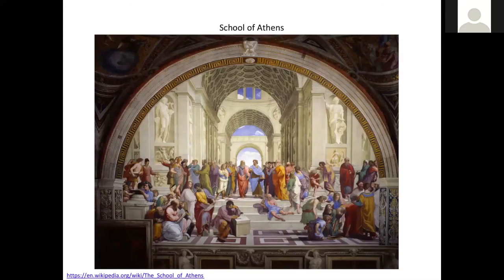In the painting, there were many ancient philosophers. Can you tell these people apart? Can you see if it's one person standing in the center, or there are two? We cannot, because we don't have enough picture resolution. But by increasing the magnification, can you start seeing there are two people standing in the center now? Then by further increasing the magnification, we get even better picture resolution. Okay, let's keep zooming in.